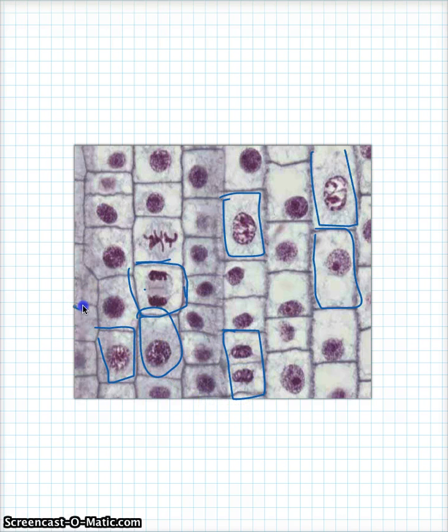Here's one that I think is an interphase. And then sometimes, like this guy right here, you don't really see anything. This is kind of a blur. I wouldn't count that in my count. If I was trying to count how many cells are in each phase, I just wouldn't count that one.